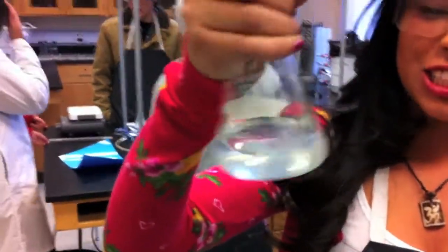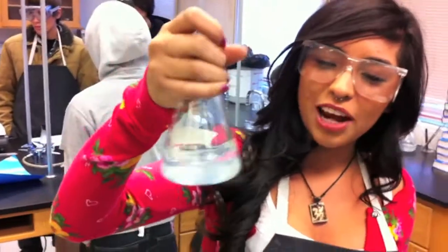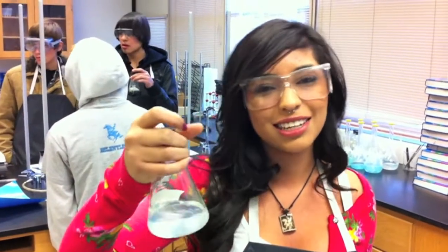I'm expecting a chemical reaction to occur, and then it'll change color — that's how you identify the chemical reaction. Not all color changes actually mean a chemical reaction, but this one does.